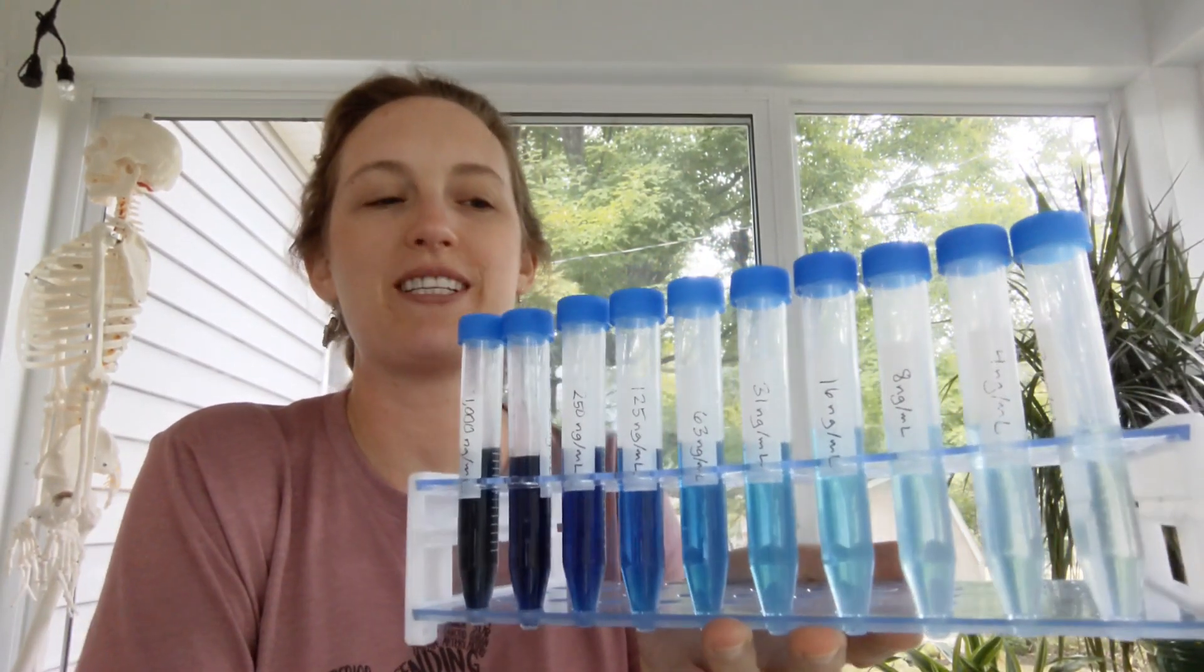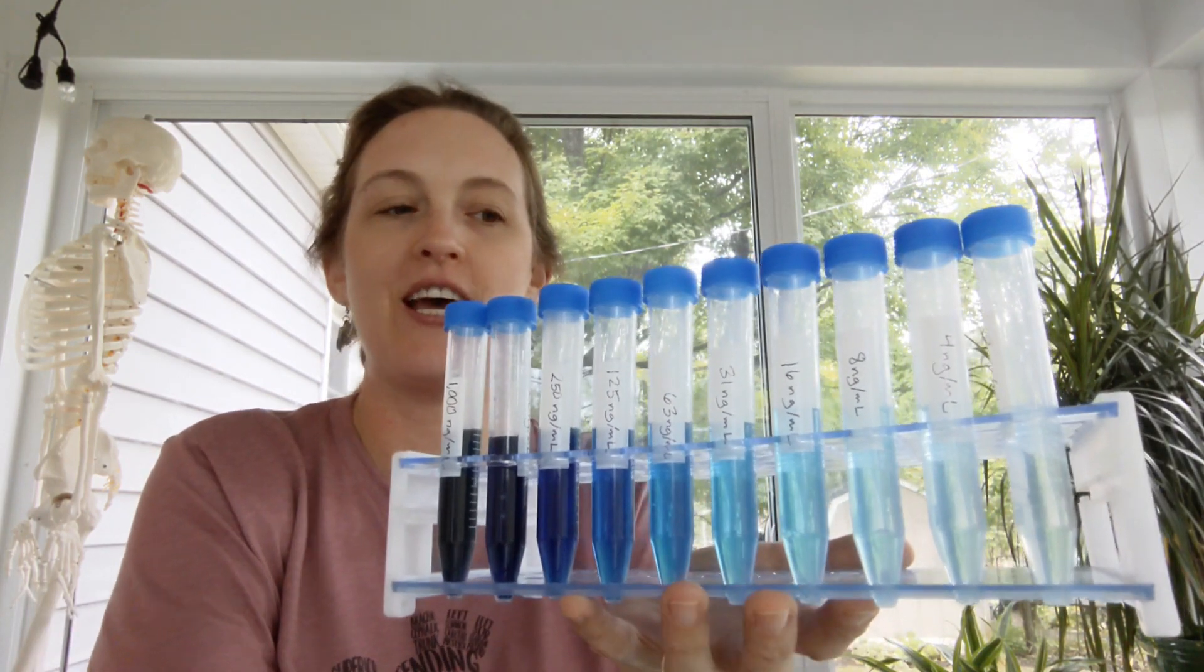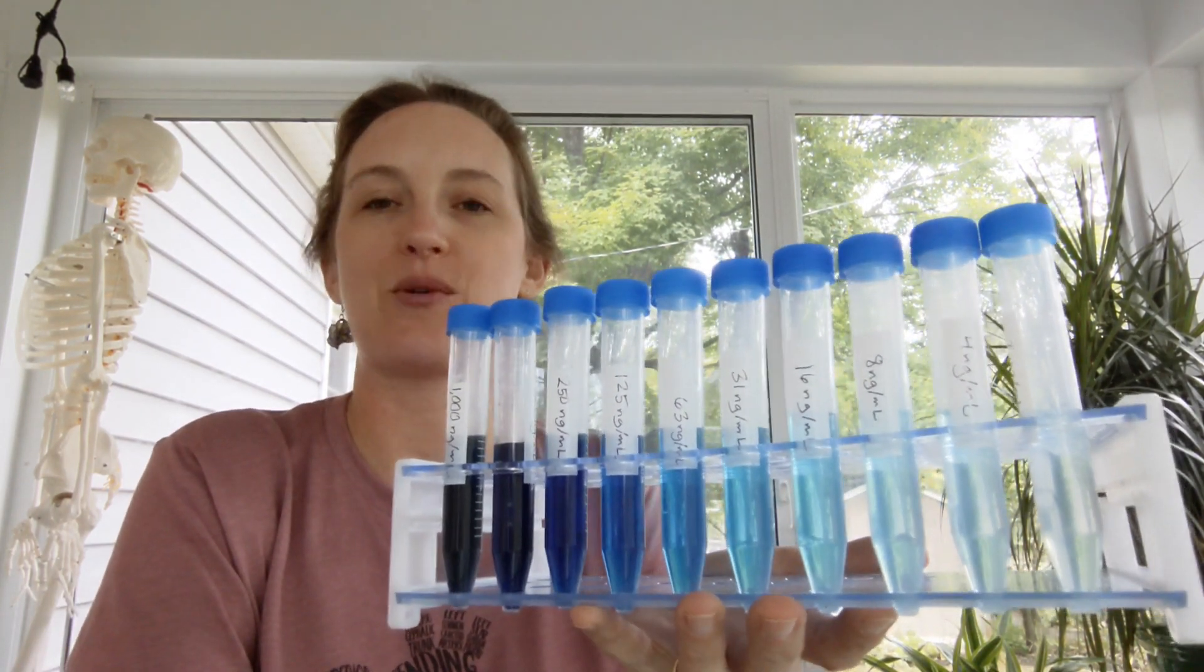Hi guys, today I want to talk to you about how to use a serial dilution to interpret your ELISA results.